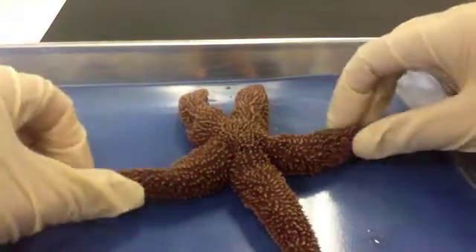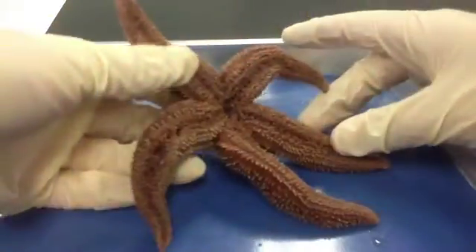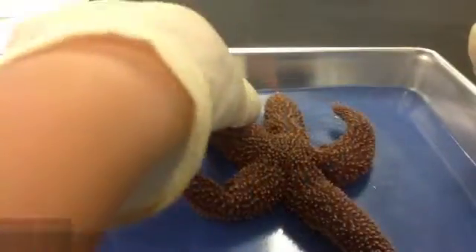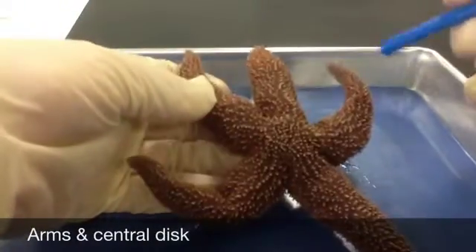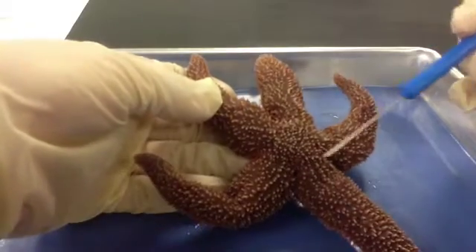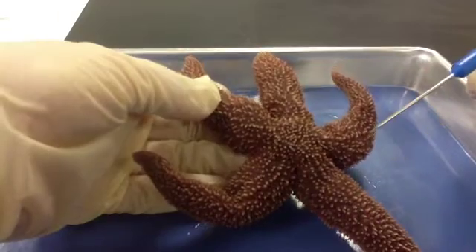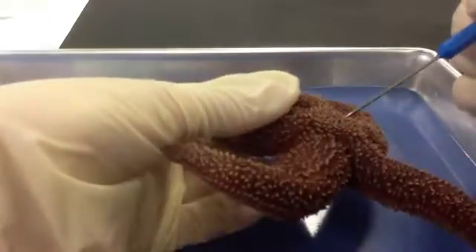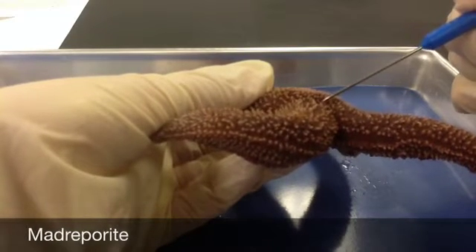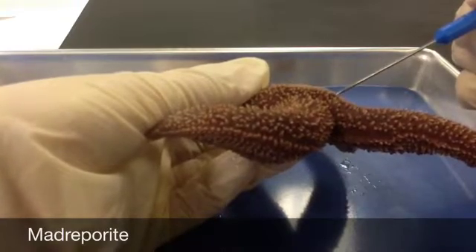The sea star doesn't really have an anterior and posterior. We have our aboral side on top and our oral side on the bottom with its oral cavity here. The sea star has five arms attached to a central disc right here. I want you to count and record the number of arms or rays your sea star has. Locate the small, round, hard plate called the madriporite on top of the central disc — mine is right here — and water is going to enter into the water vascular system through it.